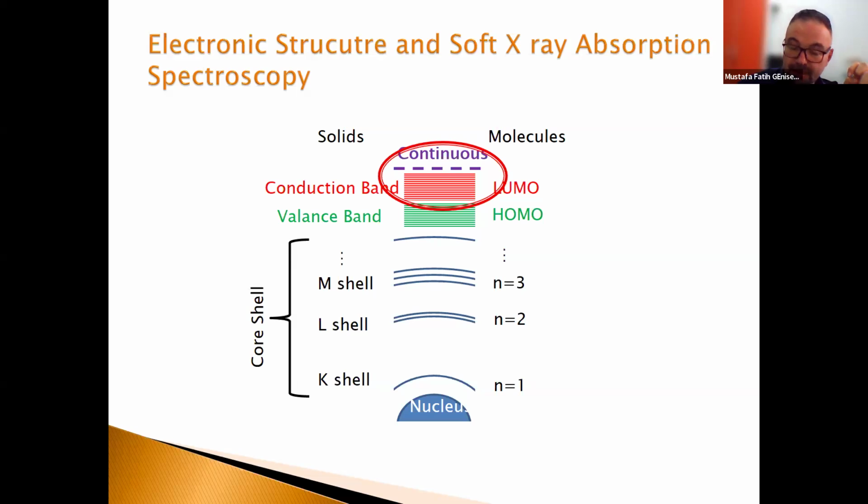But yes, in some organics, for example, people brought some metal organic framework last year. In some samples, they're affected. We understand it because they change color, but some of them weren't affected by this. Yeah, it causes degradation. Yes, we have to check it before we start the measurements. We have to be careful. You're right. Okay. Thank you.